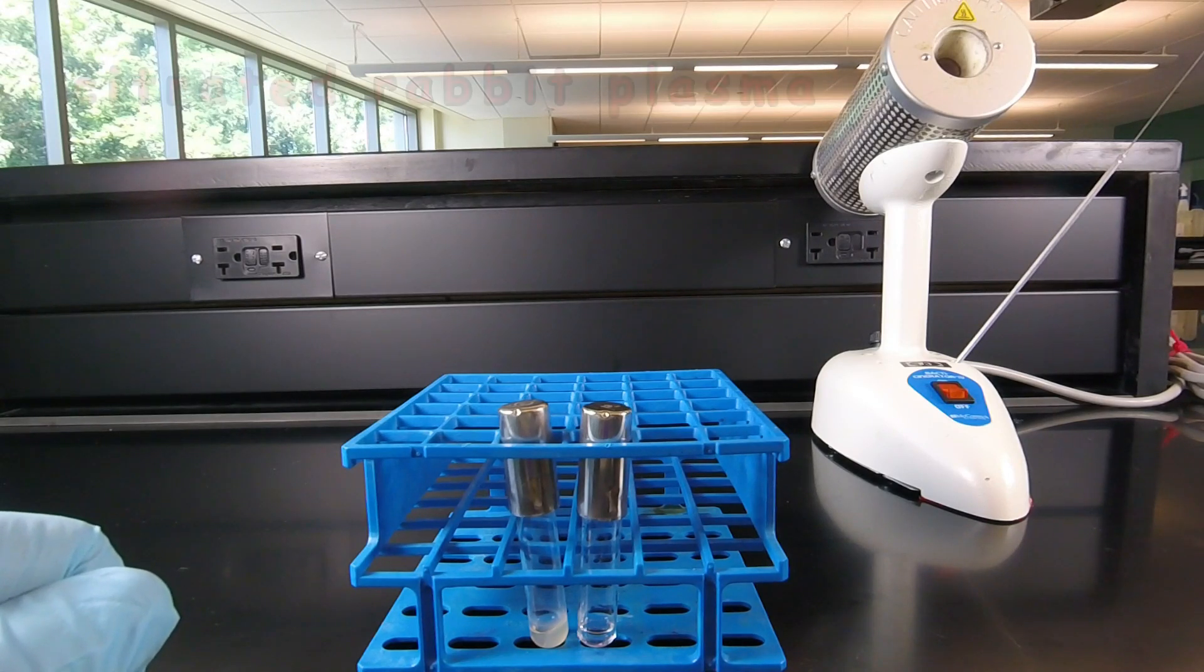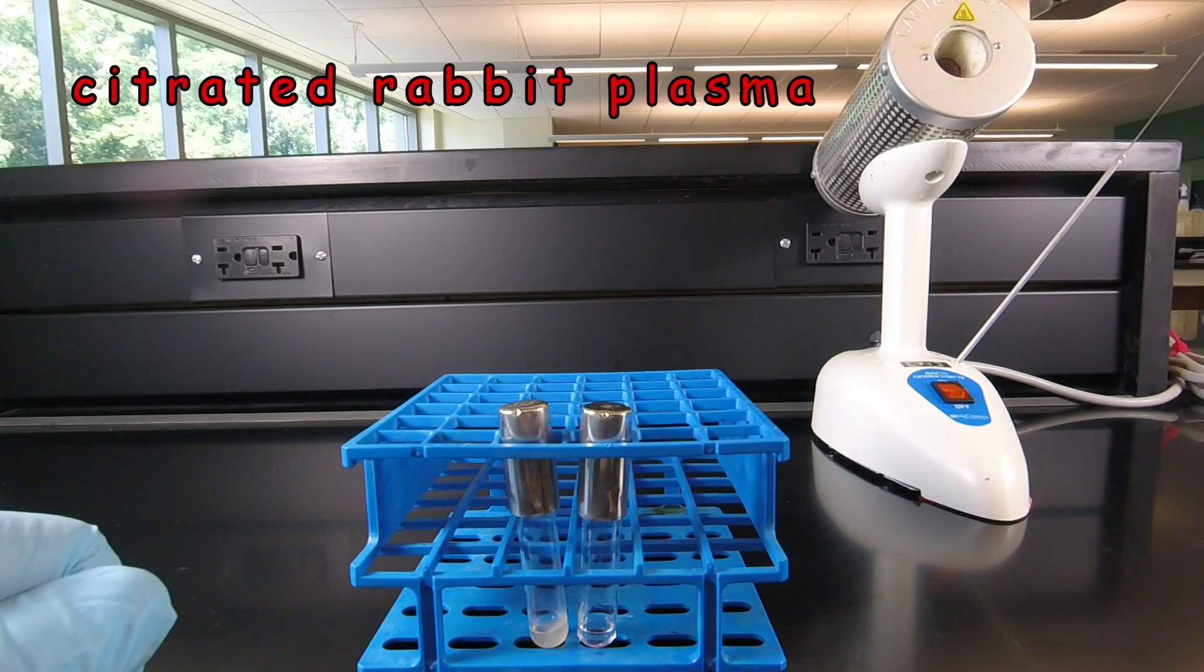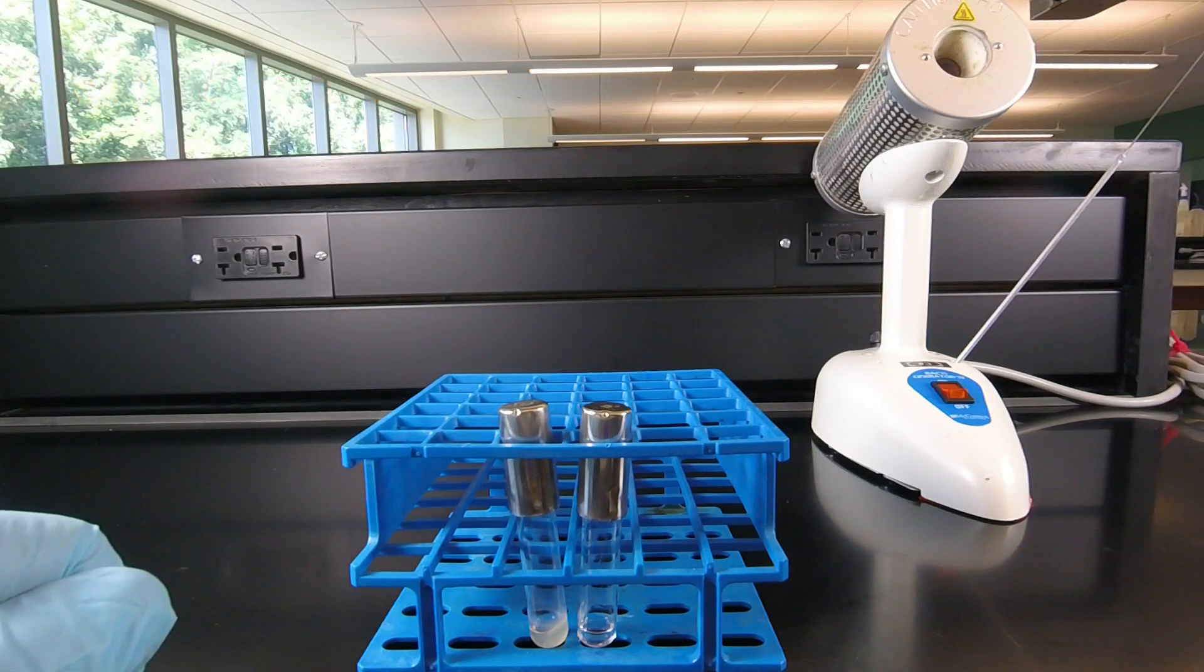which causes citrated rabbit plasma to gel or coagulate. The enzyme coagulase causes soluble fibrinogen to be converted into insoluble fibrin.